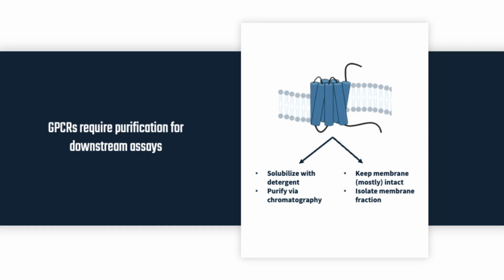And the purification process of GPCR will also typically include the use of multiple detergents and lipids that might be challenging to measure interaction for immobilization-based systems.